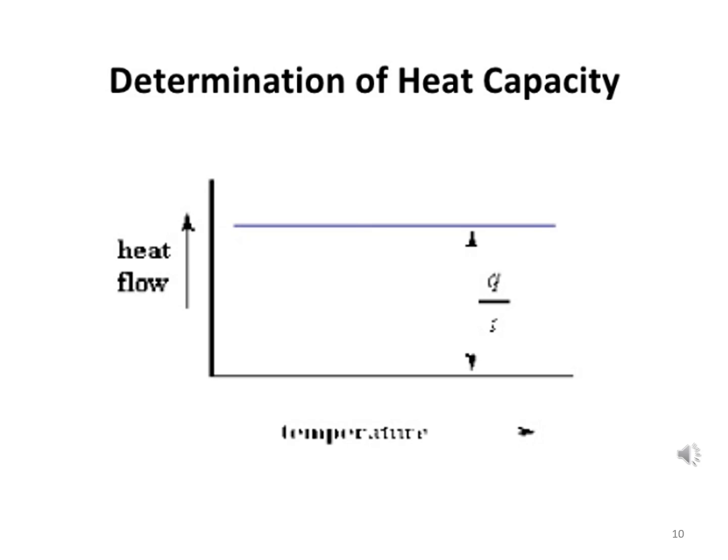The specific heat or heat capacity of a material can be determined quantitatively by using DSC, and it is designated as Cp, as the values are obtained at constant pressure.